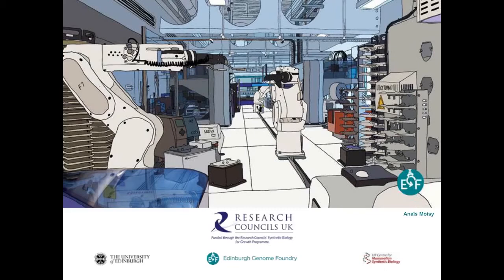Do you do your own agar plates? We do indeed. It can be a fairly arduous process, but we do indeed. It's a very bog standard process. We take molten agar and we pour it in an omni tray, which are the rectangular SBS-sized containers that you saw earlier. It does have to be fairly consistent. It has to be fairly flat because the Qpix doesn't like plates which are very bumpy or very uneven. But it is a manual process, yes.